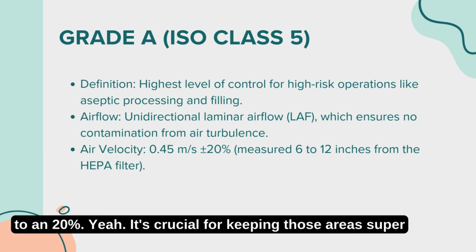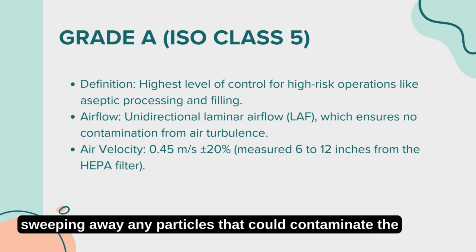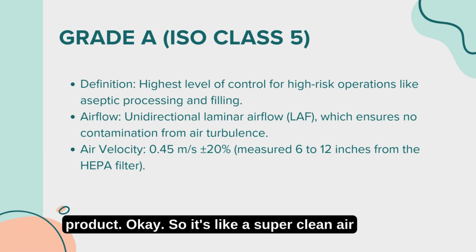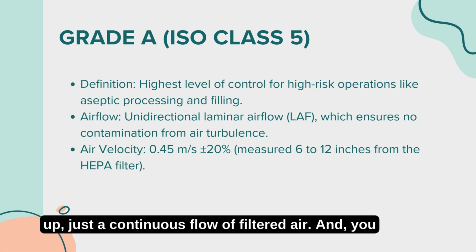Yeah, it's crucial for keeping those areas super clean. Imagine a constant gentle breeze sweeping away any particles that could contaminate the product. Okay, so it's like a super clean air current. Precisely. No turbulence to stir things up, just a continuous flow of filtered air.